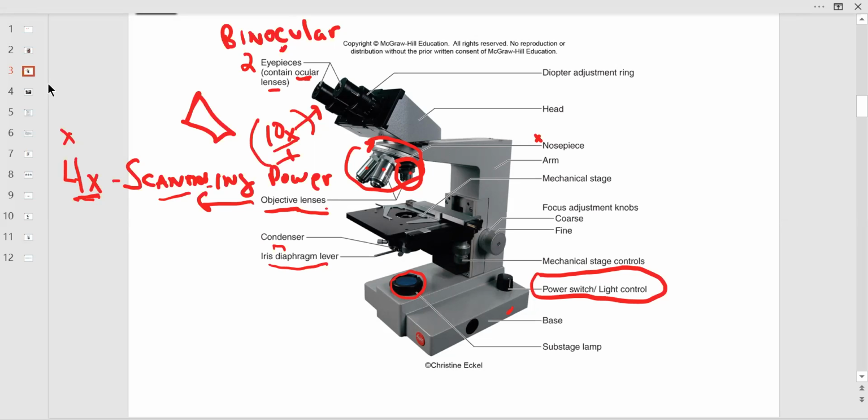And then, of course, now you get a microscope slide, which you'll see in another thing. The microscope slide is a rectangle transparent glass. Then let's say you want to check your DNA. You want to send it in, but you want to at least see how they do it.